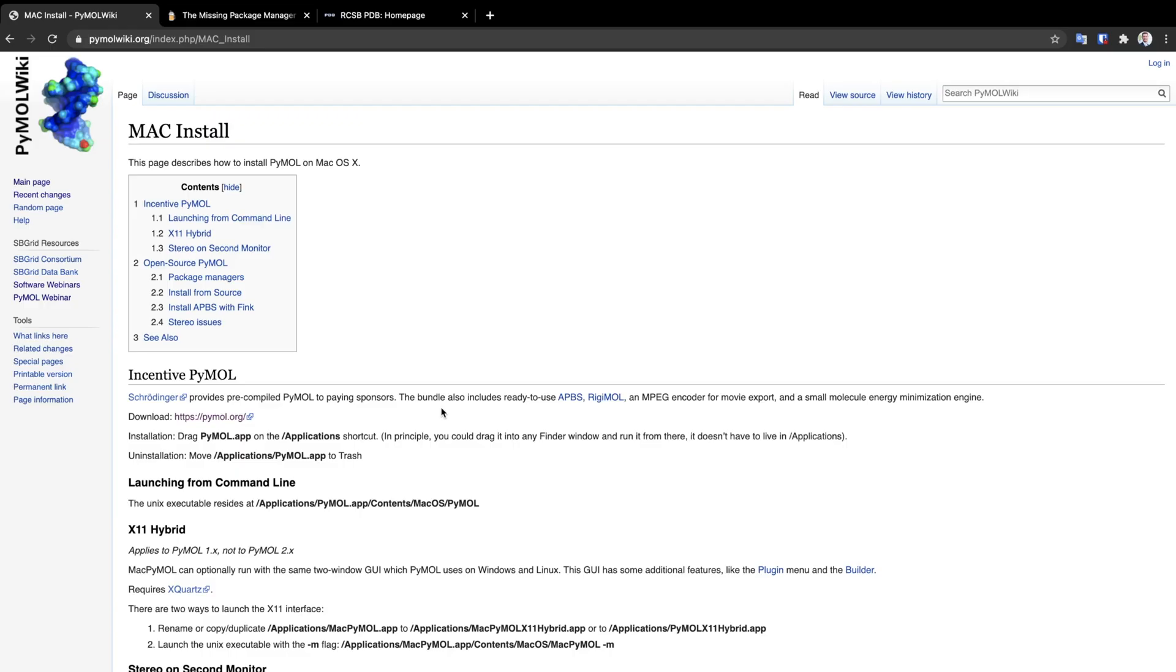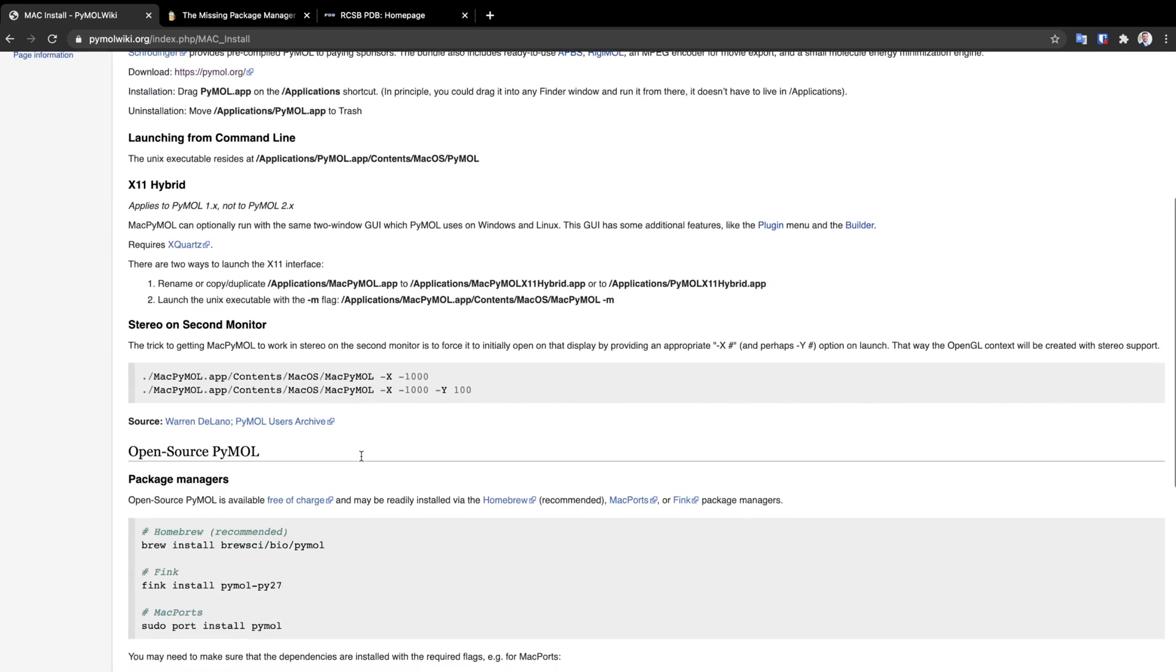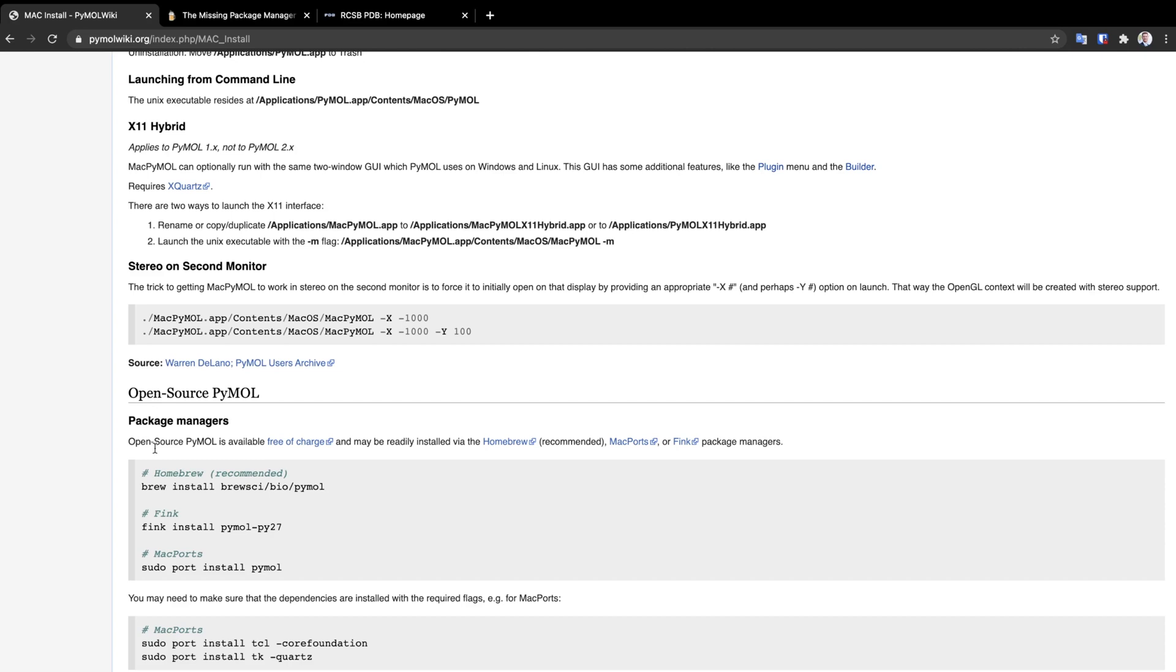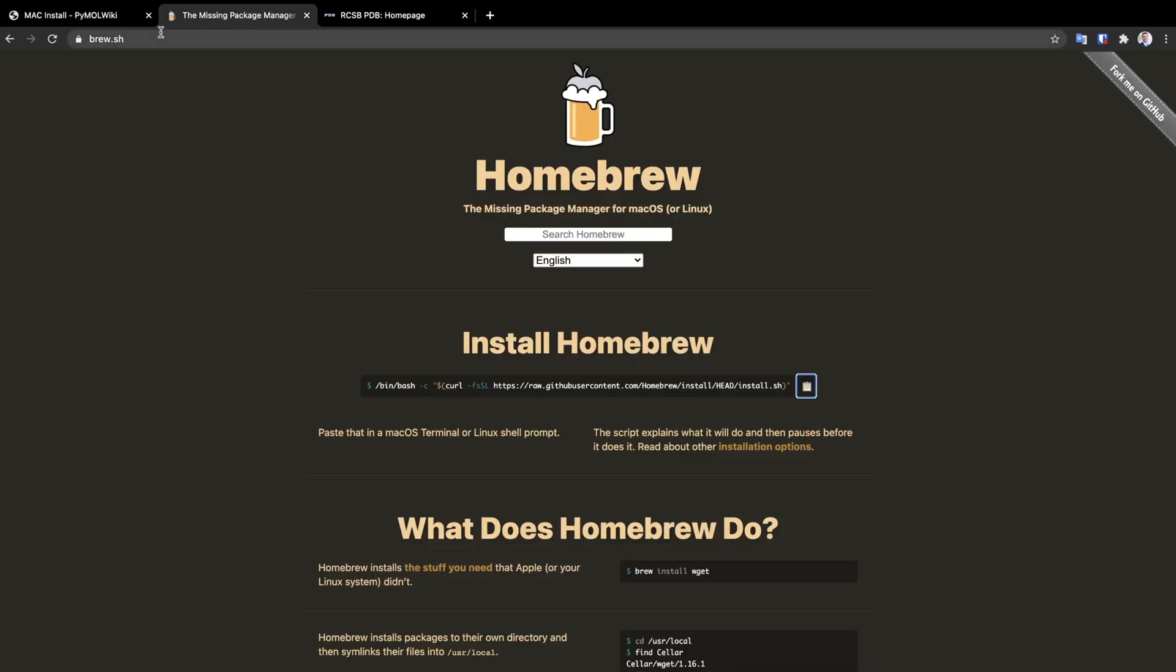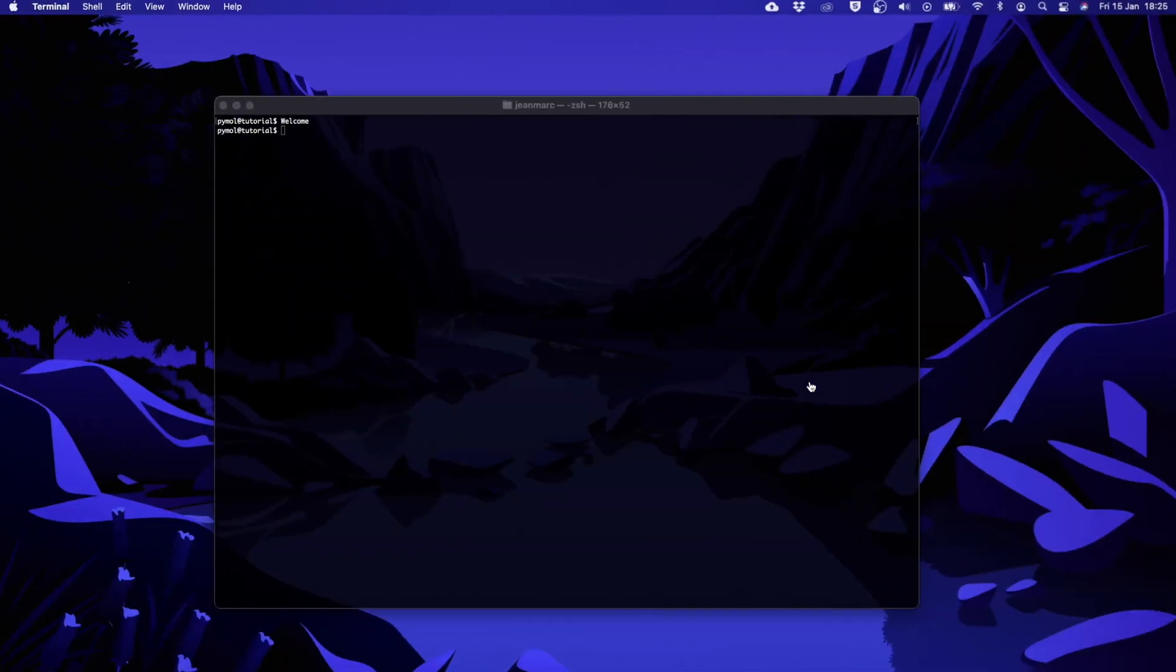Outside of the academic version, which is not free, the recommended way to install PyMOL on a Mac is to use a package manager called homebrew. To do that we want to go on the website brew.sh to copy the command line and to paste it into a terminal.